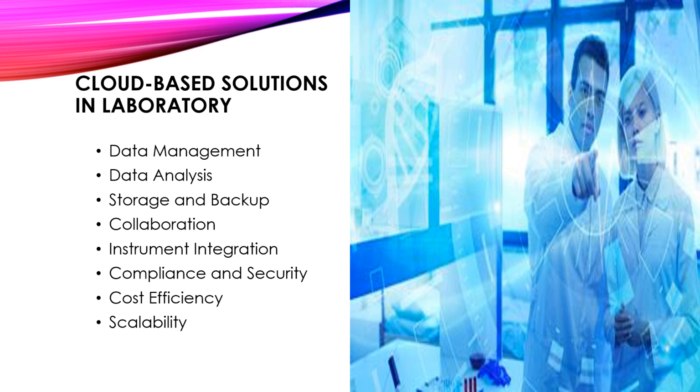Compliance and security. Cloud-based solutions often include robust security features and compliance measures to protect sensitive laboratory data. These platforms adhere to industry standards and regulations such as HIPAA for healthcare data or GDPR for data privacy, ensuring data security and regulatory compliance.